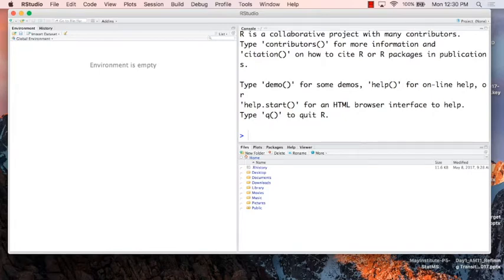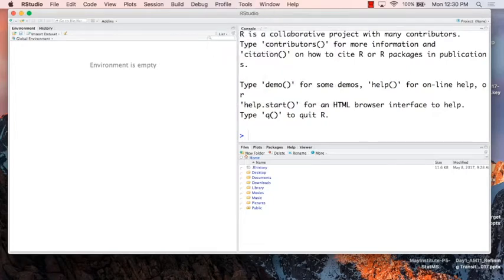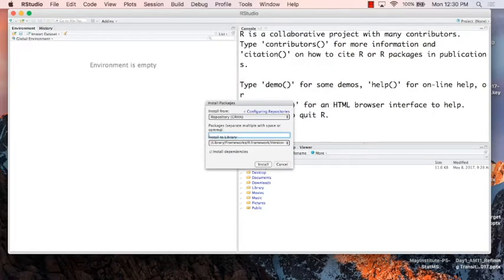Before we start to use MSstats, everyone should have installed MSstats, but I actually updated something, so let's try this. Go to RStudio, click Tools, click Install Packages. If anyone has a problem, please put up your pink sticky note and the TAs will help you. The text here is really small, but if you click here, one option is CRAN and one is package archive files. So click package archive files.